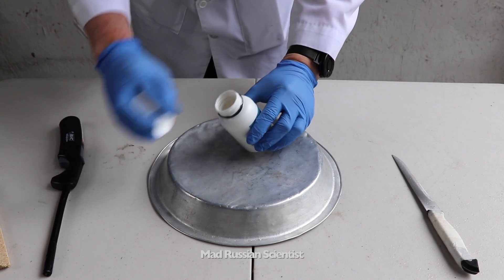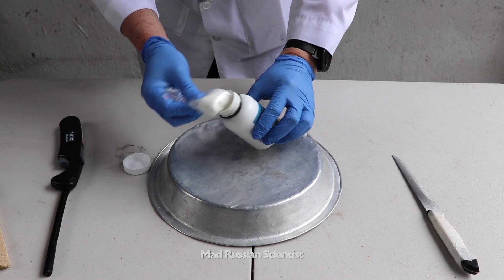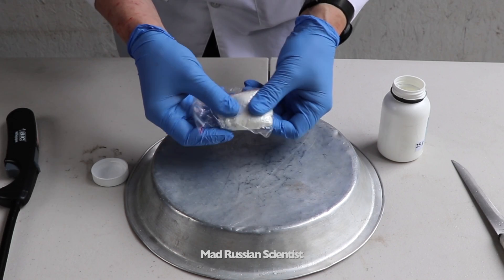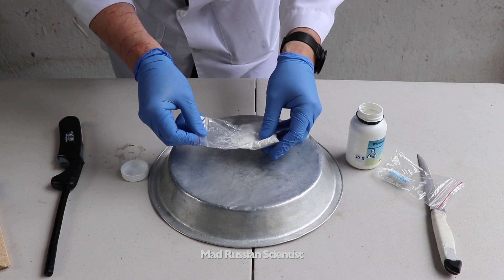I haven't even opened it yet, so let's see what form it came in. Oh, it came as a powder. Look at that. Here on the bottle it says 25 grams of this powder. Well, let's see how it burns.